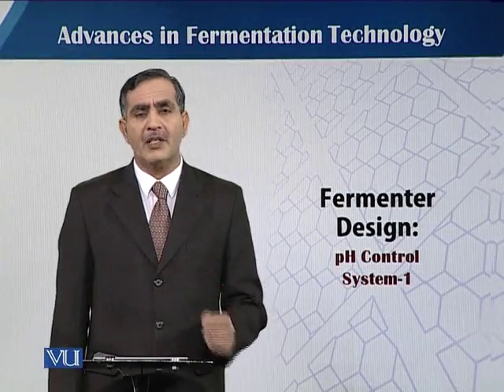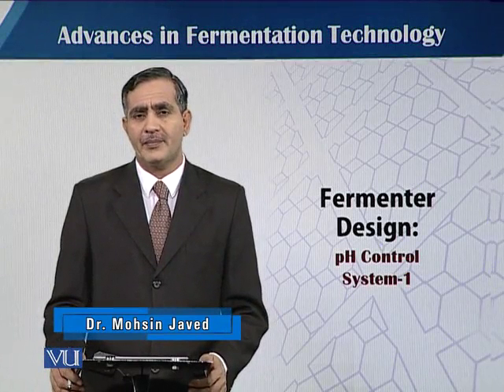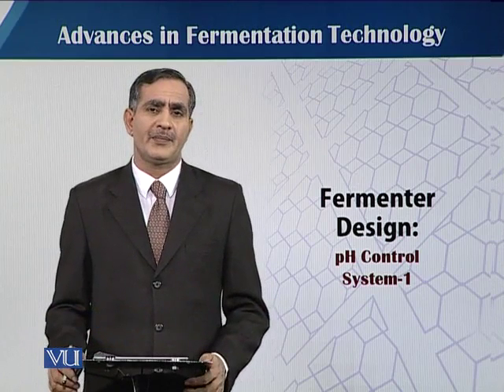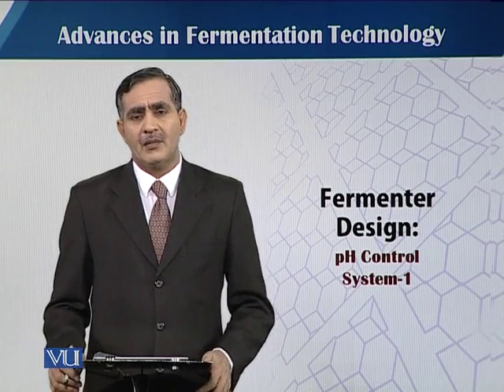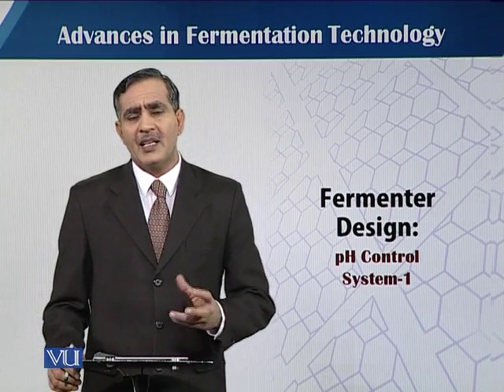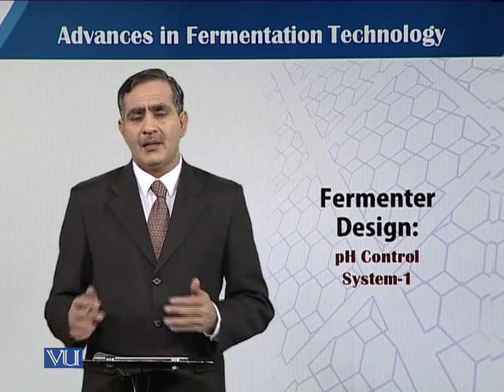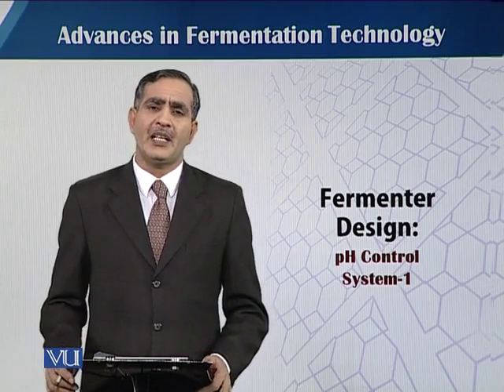In this module, we will talk about the pH control system while designing a fermenter. pH is very critical. All the biological systems require a specific pH. Minor changes in pH are controlled by the buffering capacity while designing the medium, because we add some buffer compounds which can control a minor change in the pH value.